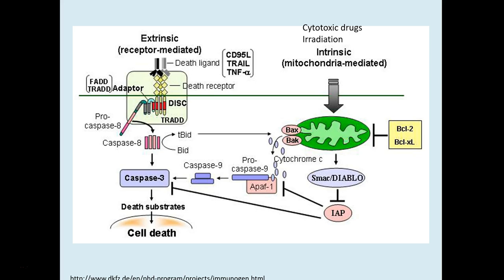The next thing you're going to do is look at an activity of a specific protein. What we're going to be looking at is caspase 3. Caspase 3 is the last protein to get activated in a long cascade of protein reactions that lead to programmed cell death response in a cell.